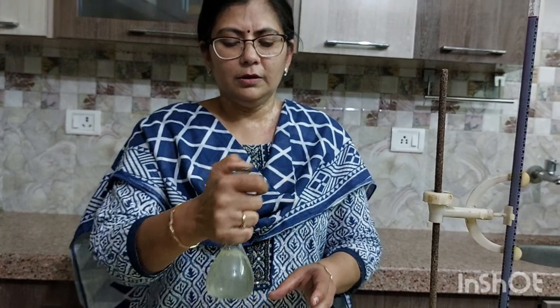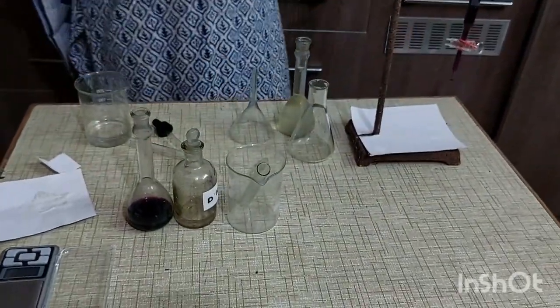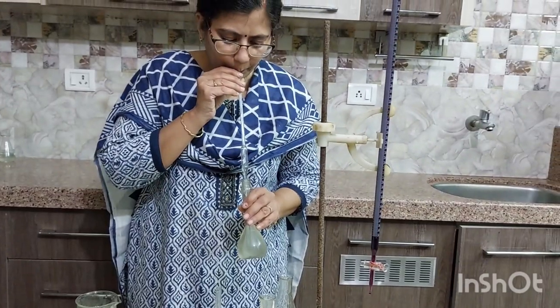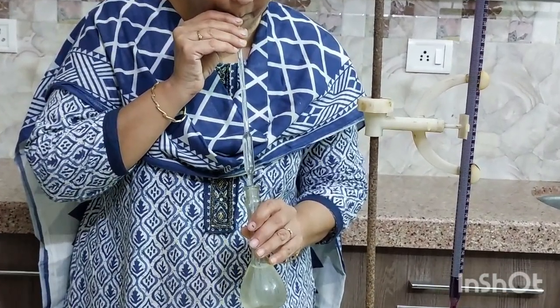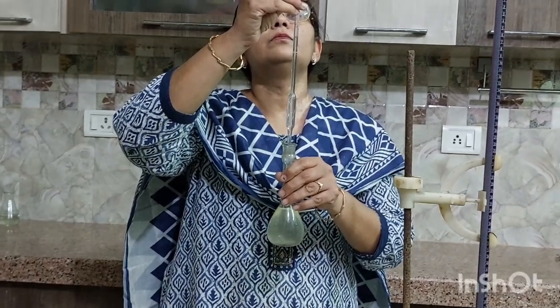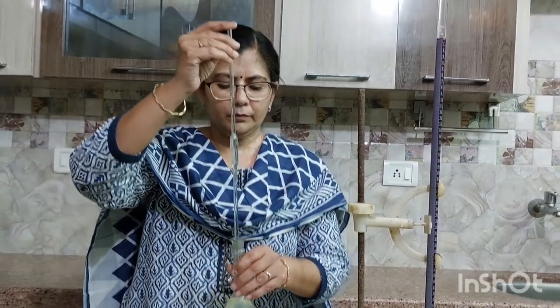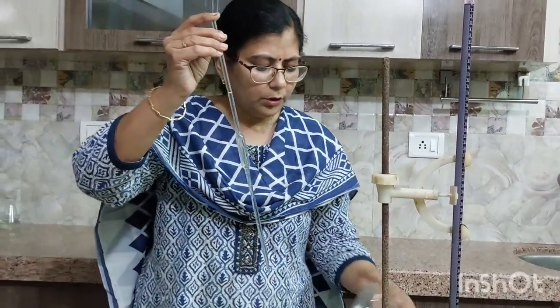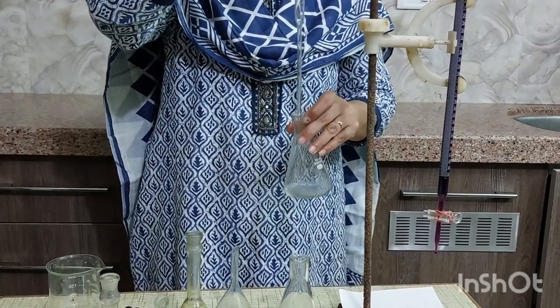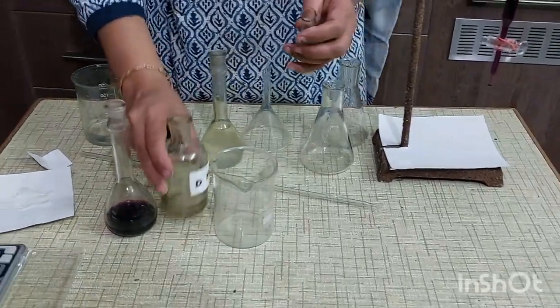Note the burette reading when a permanent pale pink color appears. Repeat the experiment to get matching readings. Shake it well and take out 10 ml of this known ferrous ammonium sulfate from the pipette. Pour this 10 ml of ferrous ammonium sulfate into a clean conical flask. And then add 2/3 test tube of dilute sulfuric acid.